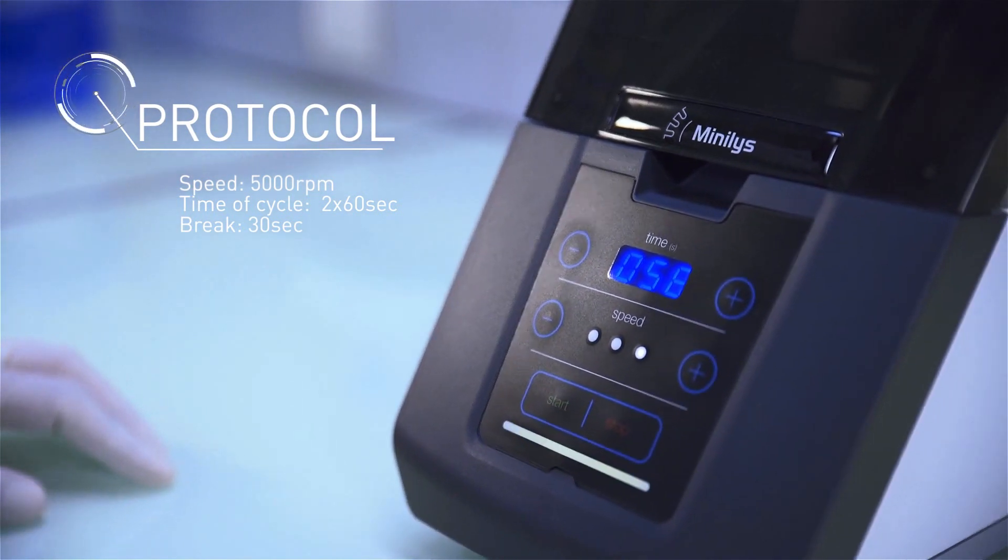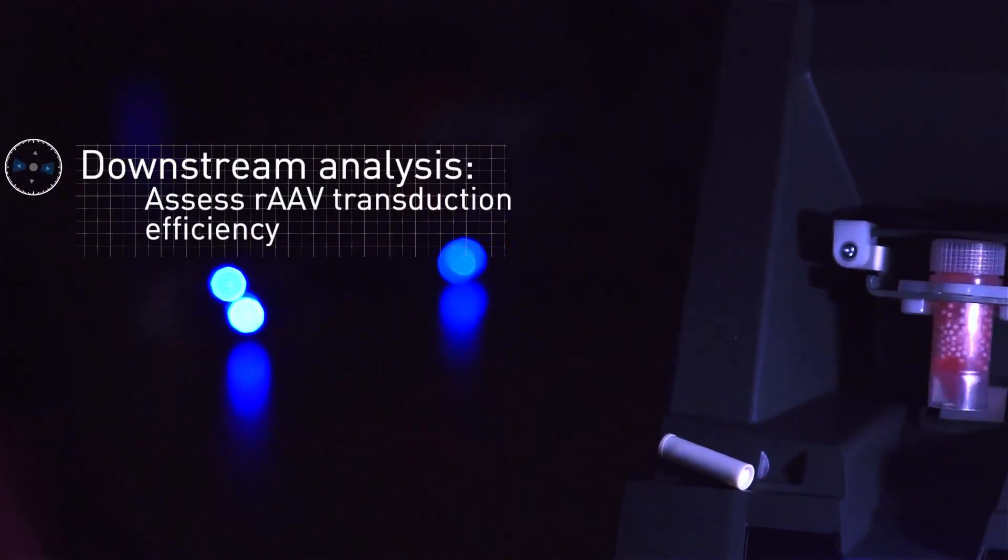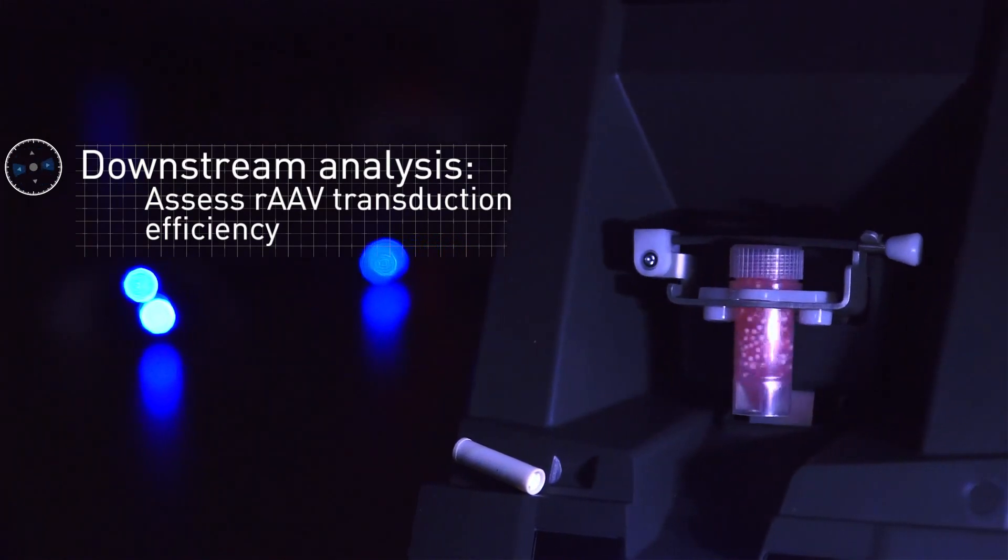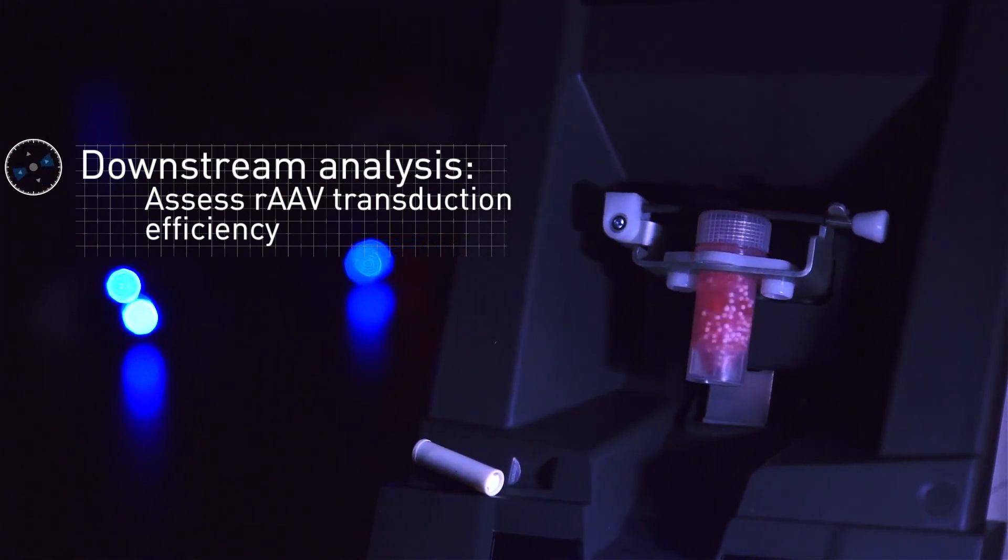Lysates from each method are used to transduce HEK293T cells and rAAV infectivity is compared by observation under the microscope.